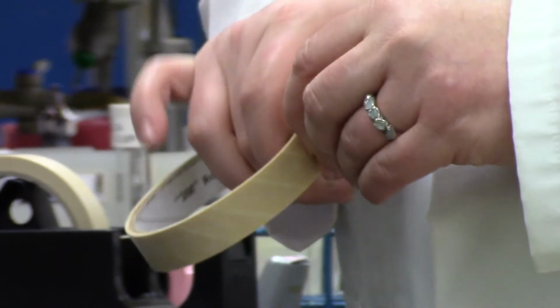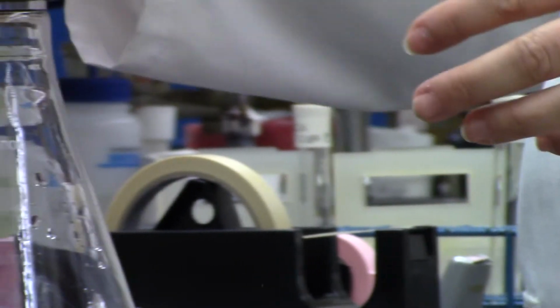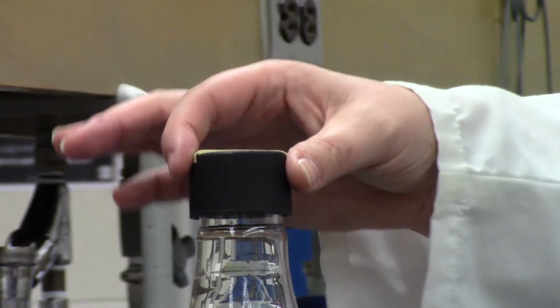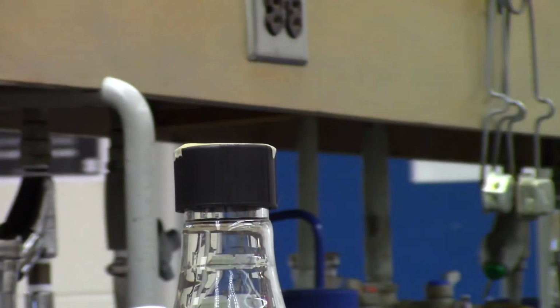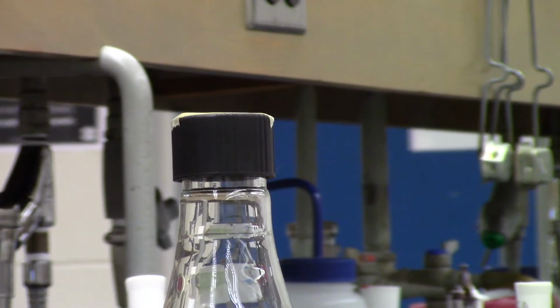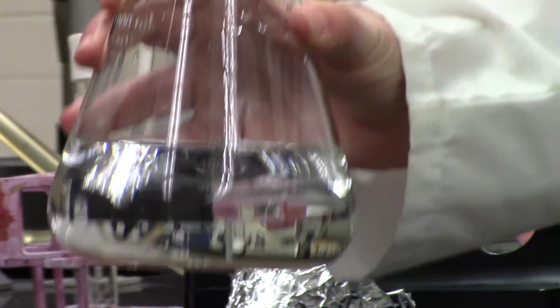So we always want to put a piece of tape on whatever goes into the autoclave so that we know that the autoclave went up to the right temperature. So we'll just put that across the lid, or we could put it on top of the aluminum foil if we were using that.